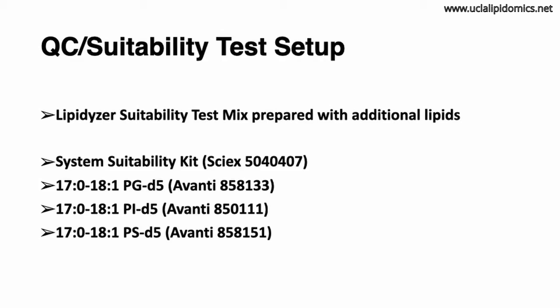While a suitability test is not required, it is recommended. It is a measurement of a set standard which can be used to track the instrument sensitivity from week to week and tune to tune. Users can settle on a range of acceptable values, and an abrupt drop in response can indicate a problem with the system. Here I'm using the lipidizer suitability mix with a single PG, PI, and PS standard from Avanti spiked in.